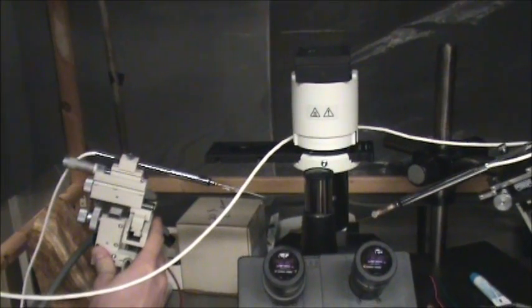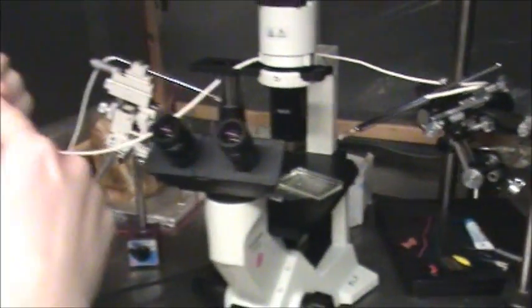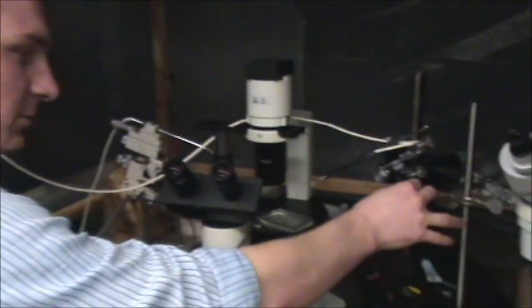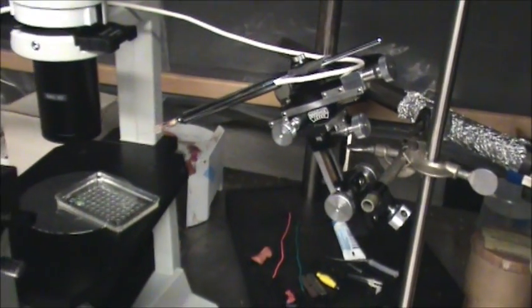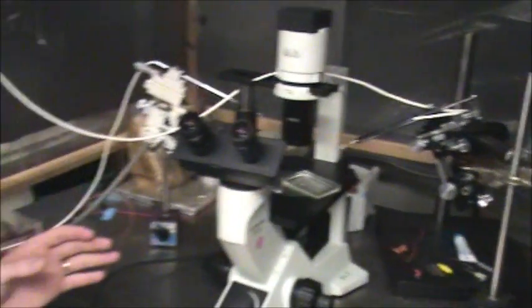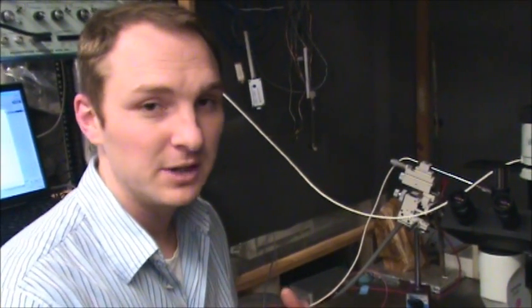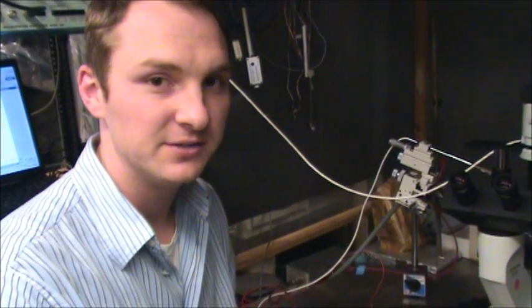We could also if we were able to get two cells cultured together to where they form the synaptic connections, it would be just as easy to have a second electrode come in and sort of activate or stimulate one cell and record the synaptic functions in the other. It's been shown that these cells will form both chemical and electrical synapses in the culture medium so you can study either type of synapse.